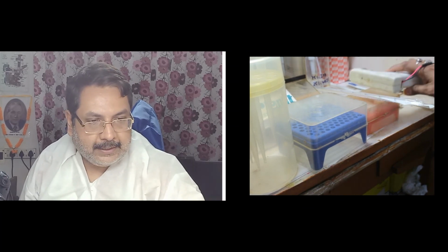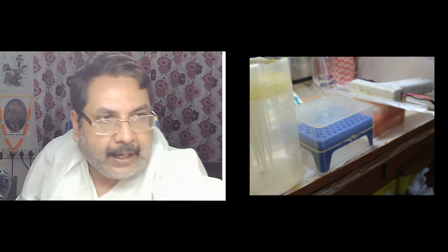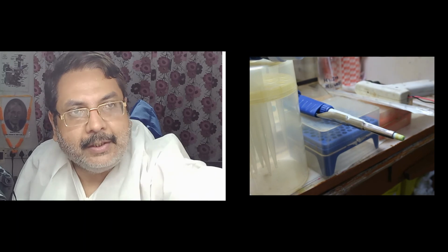And the fourth one is the pipette. This is a 5 ml pipette. So these 4 types are generally used. This is for the 5 ml. Here you can place, and this is for variable and 1 ml, and this is also another 1 ml you can use, and this is the 5 ml pipette, and this one is for the 200 micro ml micropipette. So this is the full set of pipettes.